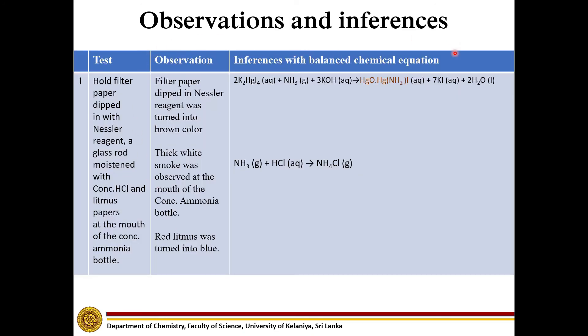Observations and Inferences: When we hold filter paper dipped in Nessler reagent at the mouth of the concentrated ammonia bottle, releasing ammonia gas reacts with potassium mercuric iodide and potassium hydroxide present in the Nessler reagent and gives rise to this brown color precipitate.